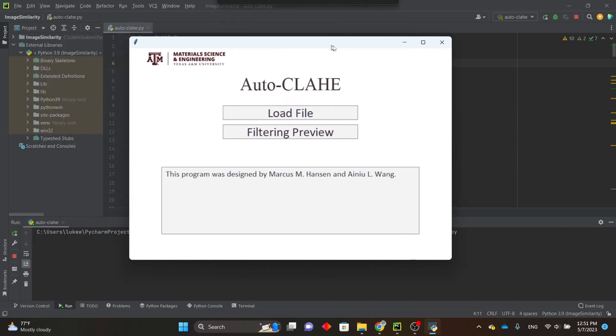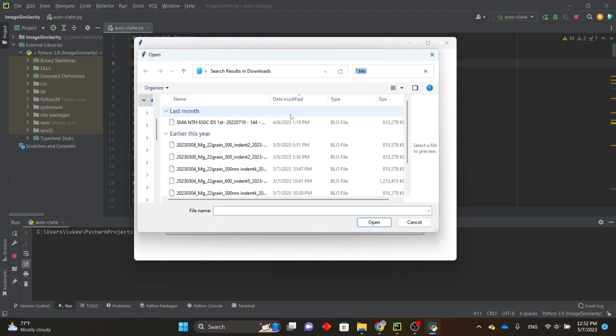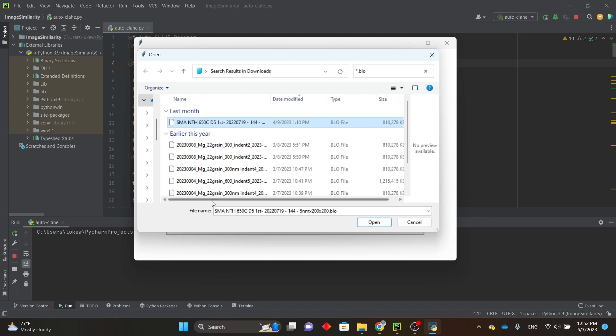So here is the main menu, and there are two options: load file and filtering preview. First, click on load file and select the data set that you want to use. It should be in a block file format and have the .blo extension. I'm just using a shape memory alloy data set.